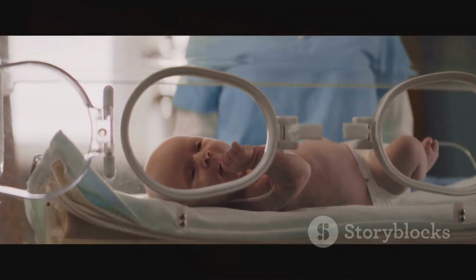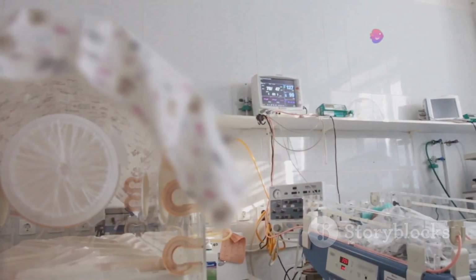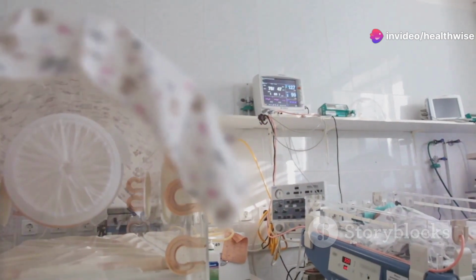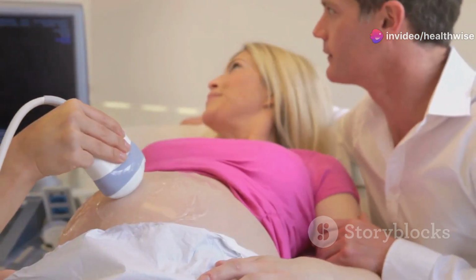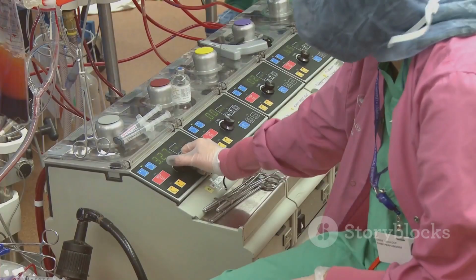Incubators are also used in IVF, or in vitro fertilization, clinics. They provide the necessary conditions for fertilizing and growing embryos outside the body. This application has revolutionized reproductive medicine and helped countless couples achieve their dream of having children.